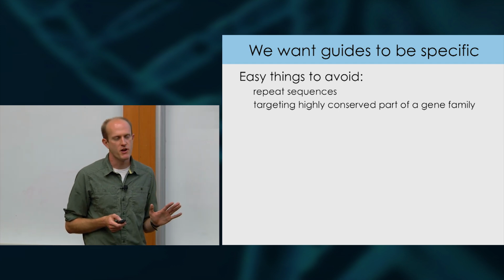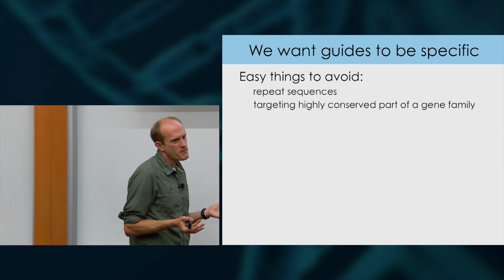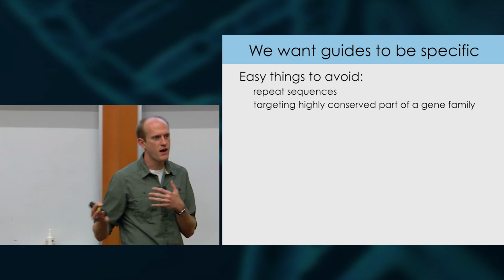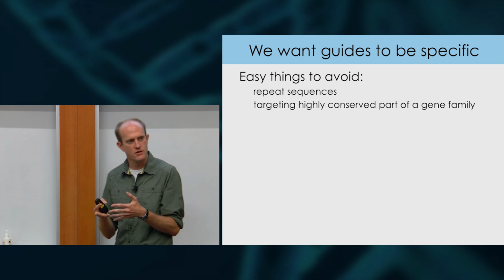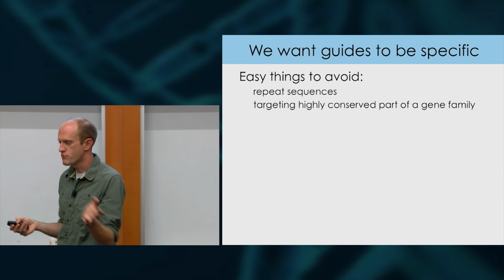That's for CRISPR-I, CRISPR-A. People have not found that so far for CRISPR cutting. But if you think about it, that's probably because people are mostly looking in bodies of exons. They're not looking around exon-intron junctions or anything like that. And so usually those regions are pretty free and clear because, especially in highly transcribed genes, polymerases are rocketing through them anyway.